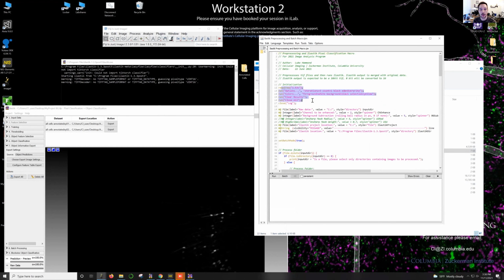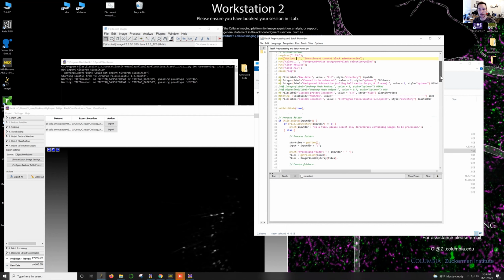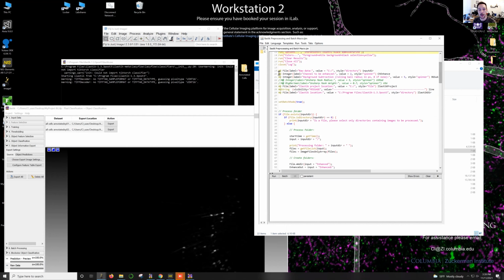These initial steps here are just to initialize and make sure that we have some settings for doing the segmentation consistently. So having the foreground as white and the background as black. These are things that can sometimes be an issue with Fiji if you're trying to do these things repeatedly. And then we have some parameters that will load in the data we want to process through Ilastik.